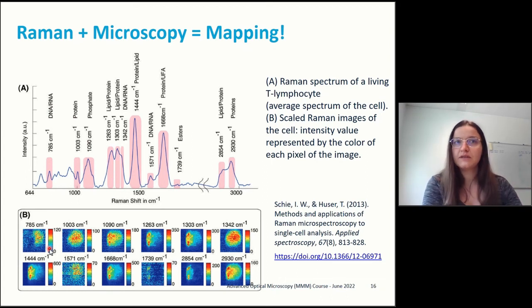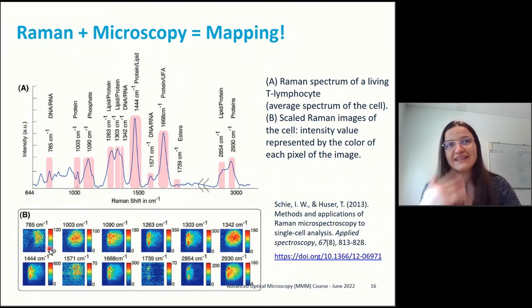So when you mix the two of them, you actually end up with a lot of power if you do this properly, because you first reconstruct the image and then you gradually map everything. So this could actually be an interesting technique, because then it's even quantitative. You could see different intensities.